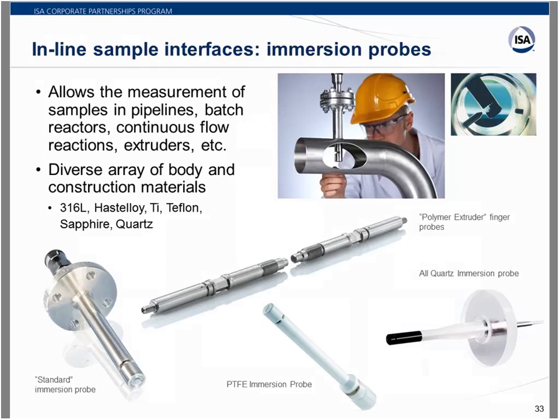Okay. So a few examples of some inline sample interfaces, and these are what you can stick directly into your pipeline, as shown by the picture of that guy staring intensely at the probe. But it allows you to actually connect your probe into your pipeline and measure things as it's flowing through. Now, we did tell you that with spectroscopy, you can take measurements in milliseconds, which allows you to have real-time analysis of your materials.